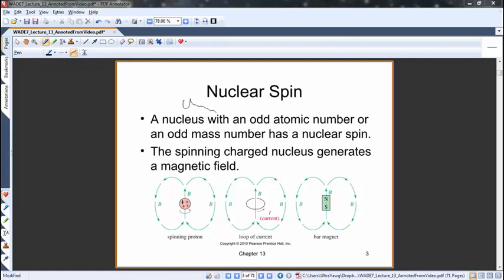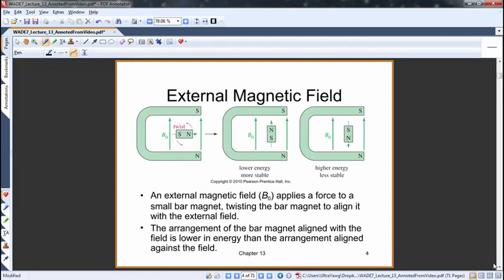So we can think about the nuclei as little bar magnets, where they have a north end and a south end. If we take those nuclei and put them into a magnetic field inside a giant magnet, when the nuclei are originally pointing in any random direction, and we apply a magnetic field with a particular strength, referred to as B0, some Gauss value, the magnet, by the nature of what magnets do, either the north end will be attracted to the south end, which is what we're accustomed to, but depending upon how the magnetic field lines run and which way the original nucleus was pointing, sometimes the nuclei will align themselves parallel to the magnetic field but pointing in the opposite direction, so the north will be closer to the north.